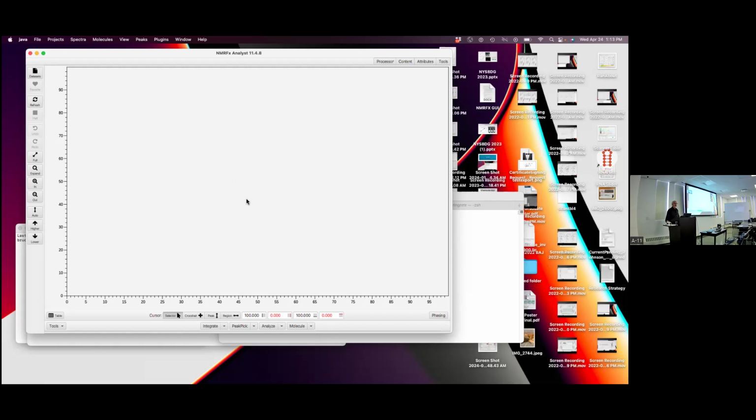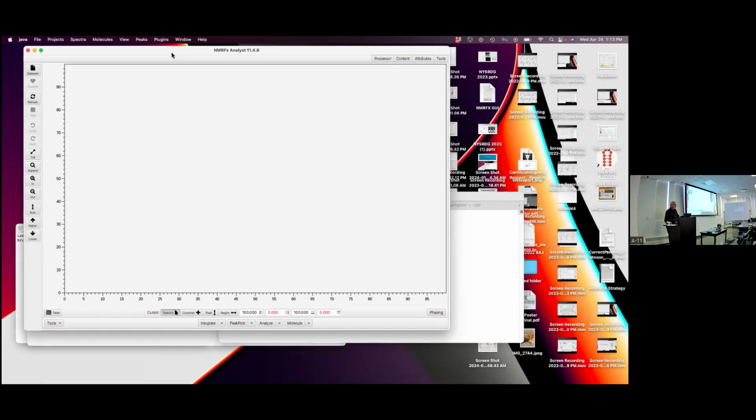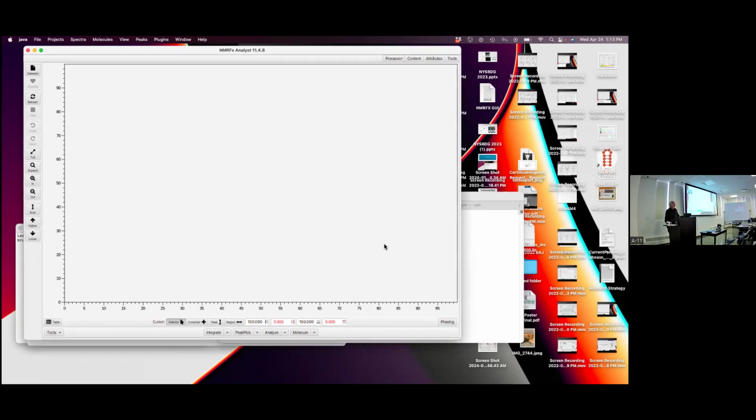People out in the Zoom world, don't hesitate to chime in if you're having troubles. It will be recorded, so that you can follow along later if you want to try things, if you're not doing it hands-on. NMRFx and ring are definitely moving targets, so we're adding lots of stuff, and every time we add 3 new things, we break one existing thing.